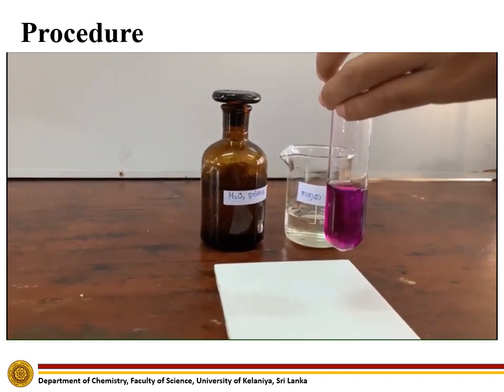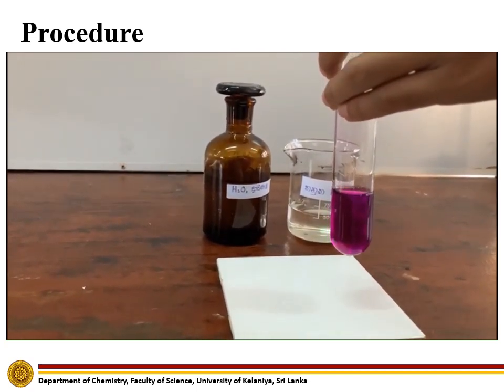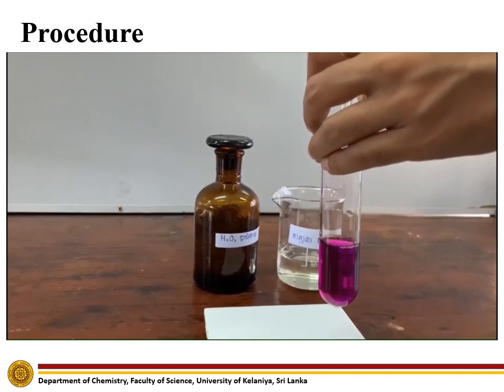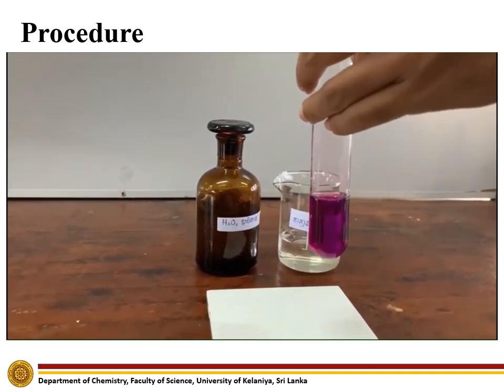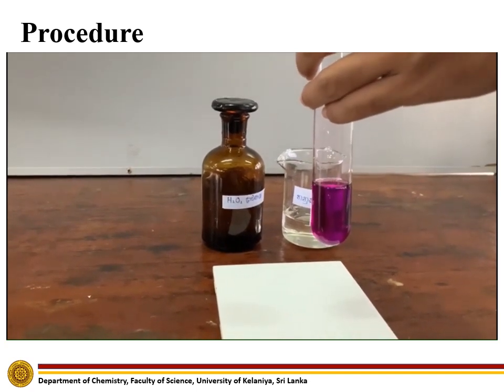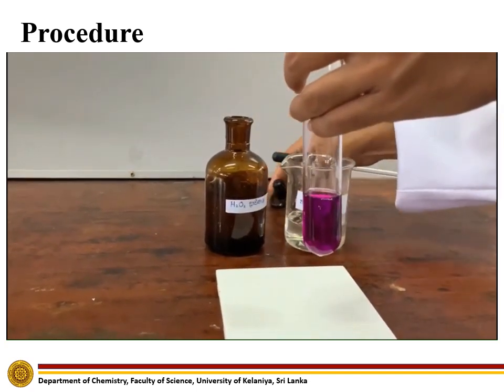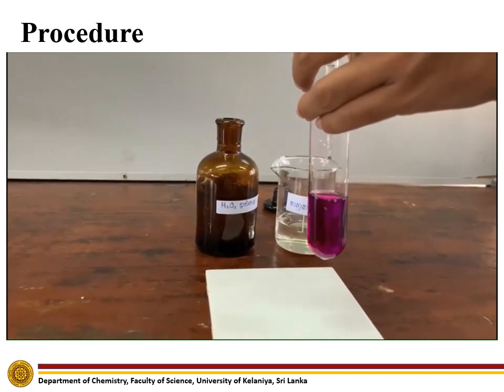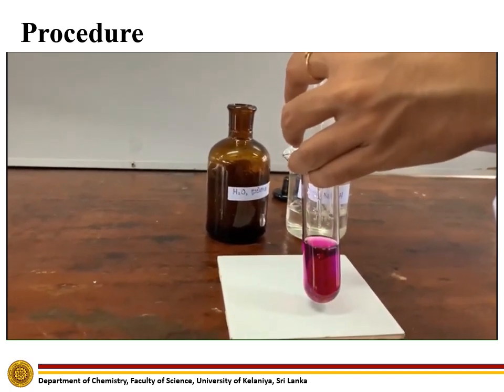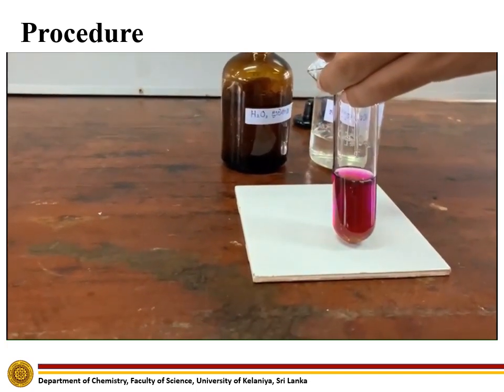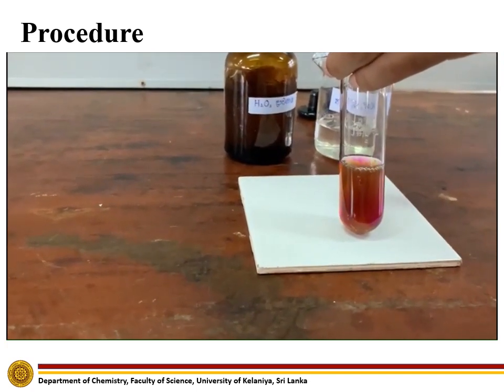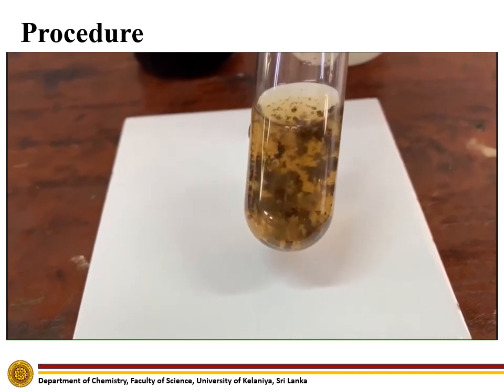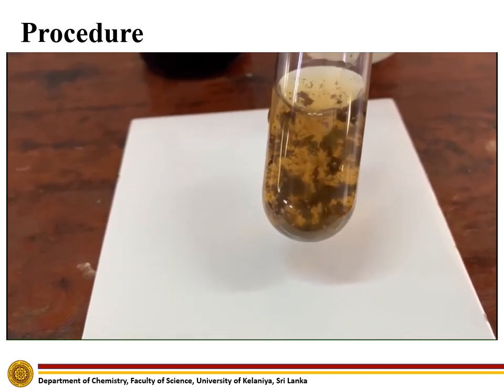As the third step of this experiment, basify a dilute permanganate solution using a few drops of dilute sodium hydroxide. After that, add a few drops of hydrogen peroxide solution and observe the color change. A dark brown color precipitate can now be observed. This resembles the +4 oxidation state of Manganese.